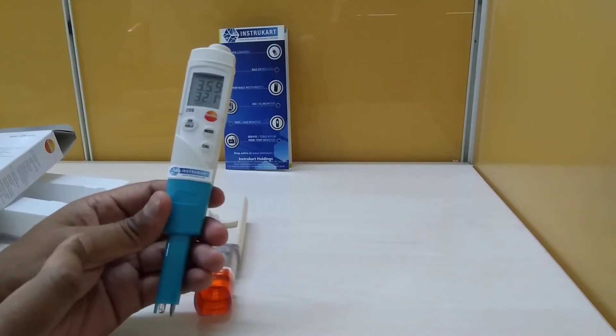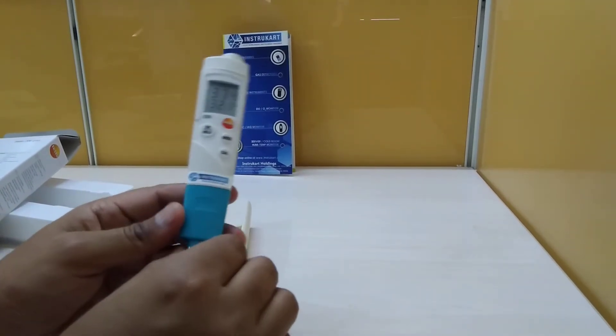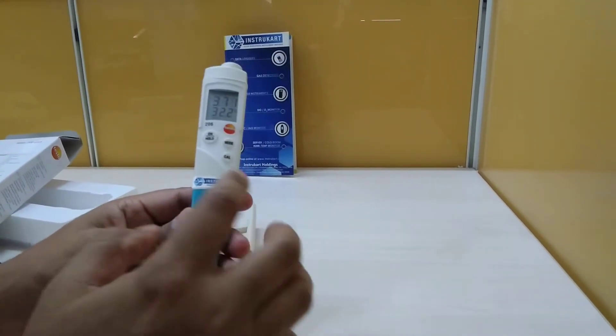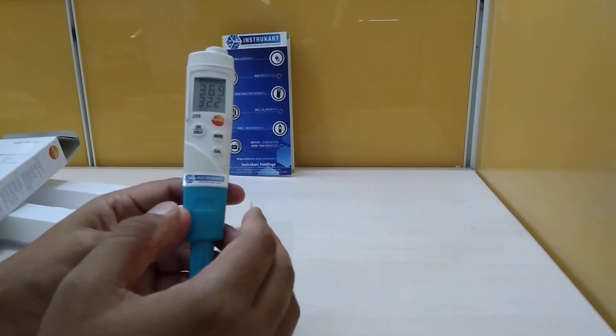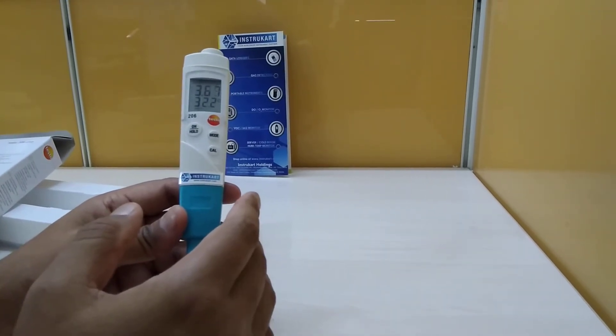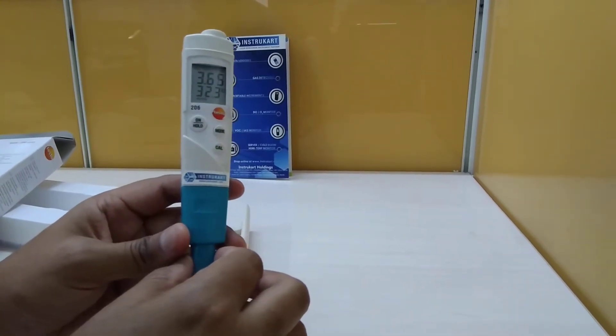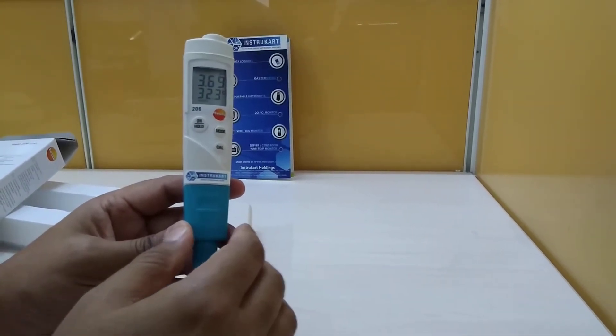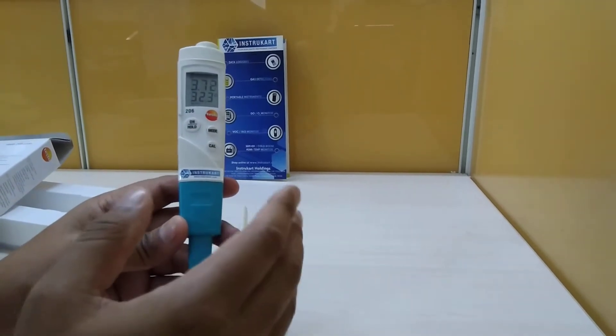This instrument has two parameters: pH and temperature. It has a pH electrode sensor and a measuring range of 0 to 14 pH with a temperature of 0 to 60 degrees Celsius, short term to 80 degrees Celsius.